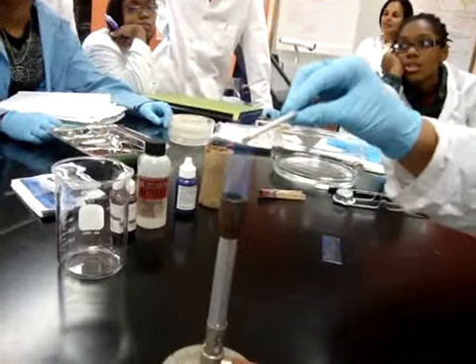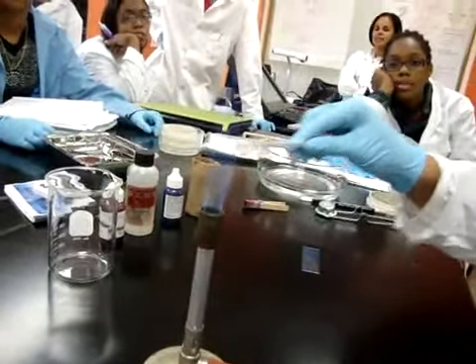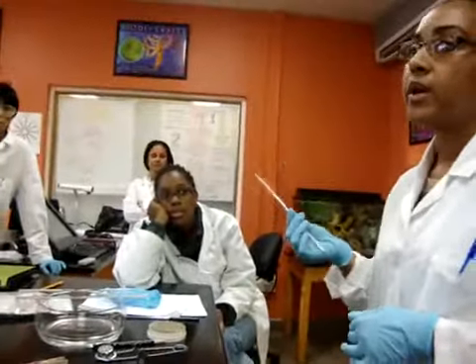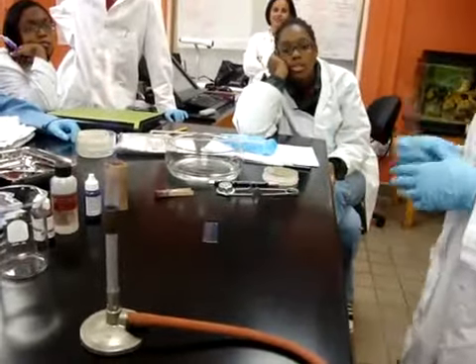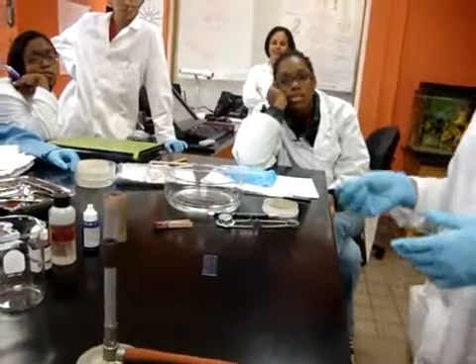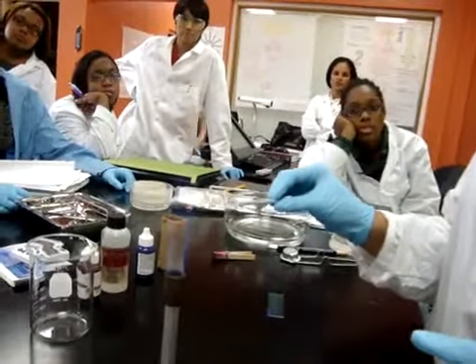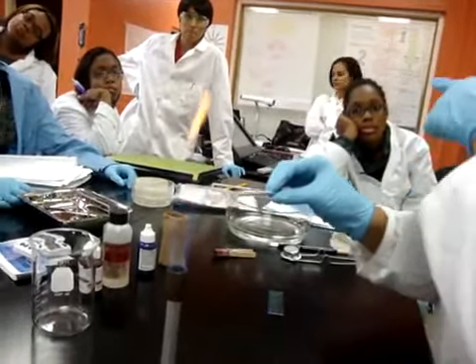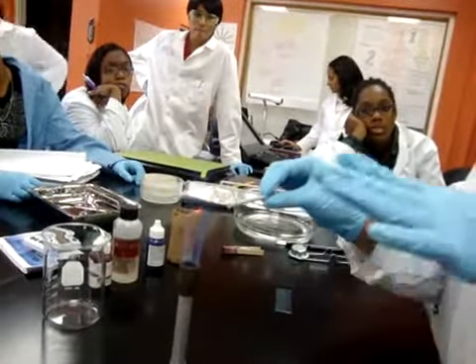Not this, but you sterilize them, right? In hot water. Yeah, it's the same concept, so they didn't need any pathogens. Okay, it's sterile right now. If I didn't use it and I put it back on the bench, and I picked it up and I wanted to do something, what do I have to do first? Sterilize it again. So the point is that you sterilize between every application, whether you put this loop on the bench, whether you put it in your bacteria, anything. If the loop touches something, it's not sterile anymore.